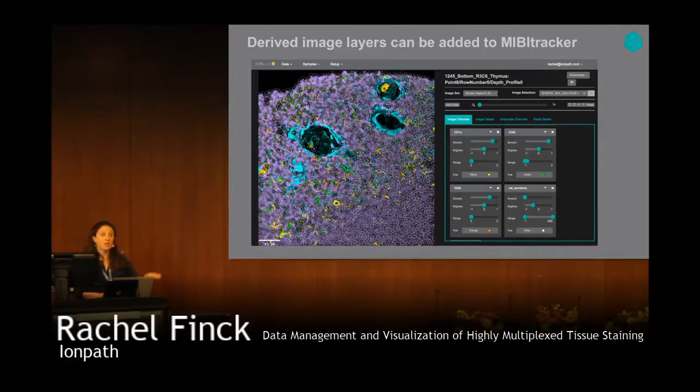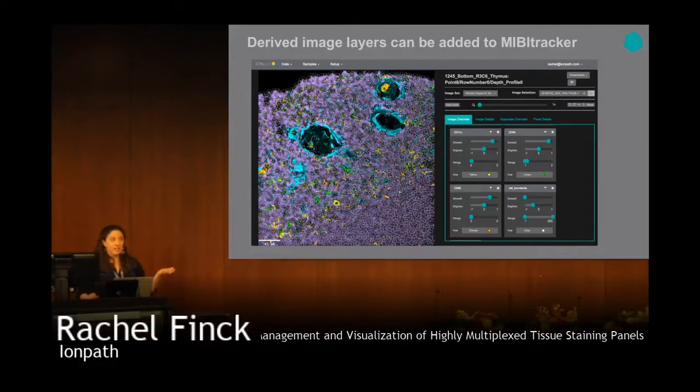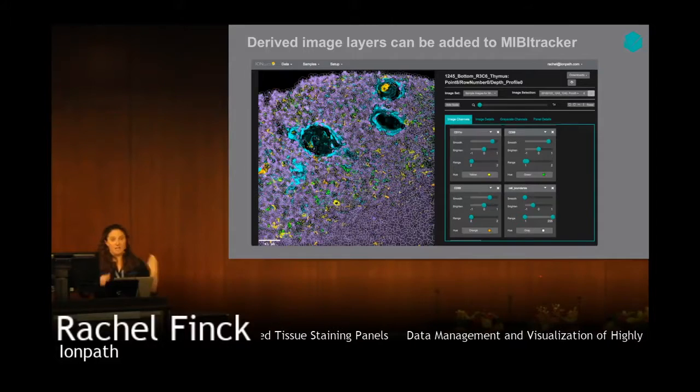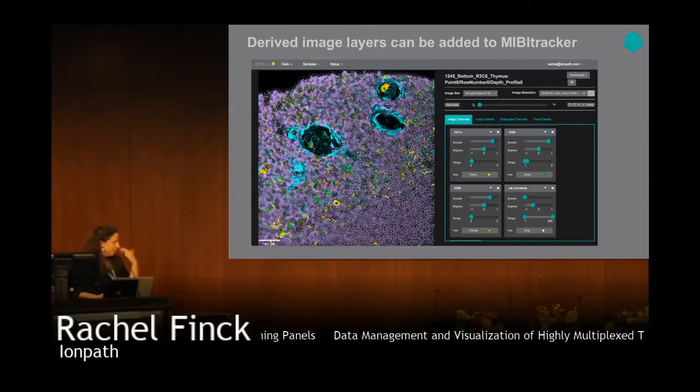Ionpath was mentioned earlier. It's one that we've used. We've also used neural nets for it, and before something's fully integrated with this tool, to be able to just hook it up, put it in there, and then again, I can send it to a pathologist, and our pathologist has already been looking at this data, and as I update it, she can say it's getting better, it's getting worse, etc. Maybe not for the segmentation, I can hopefully tell that myself, but often for other methods, I need expert help.